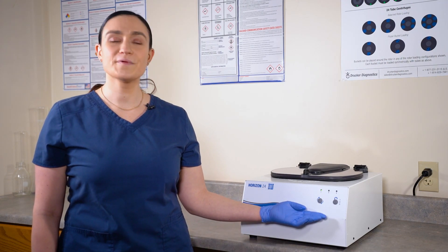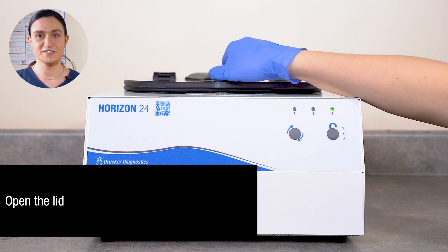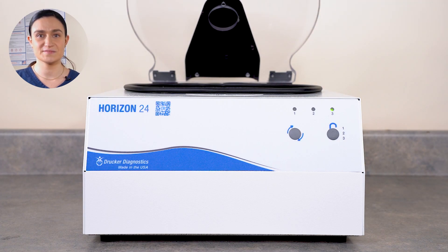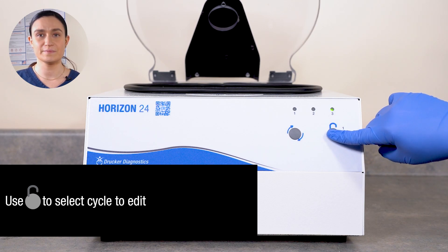As a quick reminder, your Horizon 24 has all of its controls right here on the front panel. Start by opening the lid. You may need to press stop unlock to allow the lid to be opened. Leave the lid open for the rest of this process. With the lid open, select the cycle you want to edit using the stop unlock button.